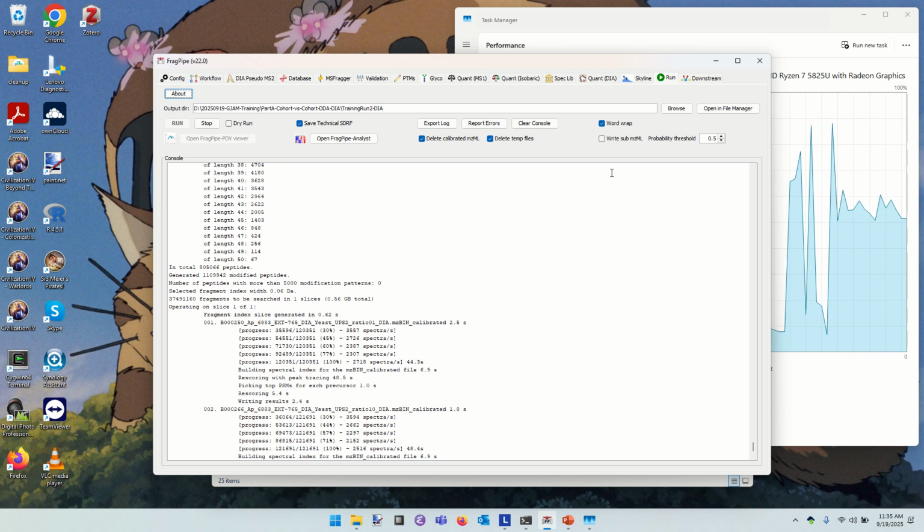It's coming up from nothing to be a very dominant ion. So the process of deconvolving that, of being able to say that the signal for peptide A has already hit its maximum by this time and it's fading away, and the fragments for peptide B are coming on strong and then will fade away later, is all part and parcel of this quantitation problem for doing DIA.